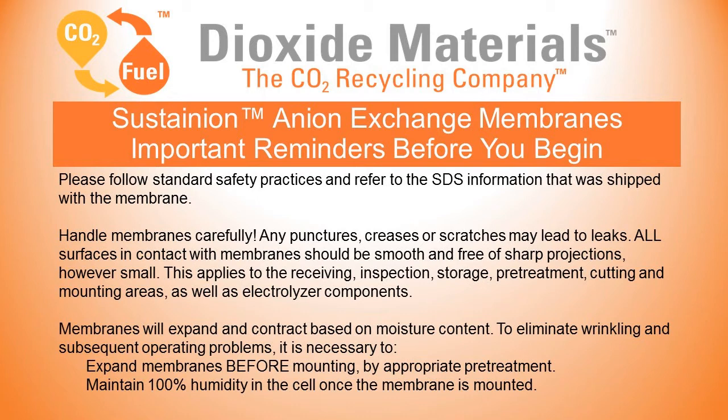Everything must be dust-free, however small. You need to make sure that this applies to any areas such as receiving, inspection, storage, pre-treatment, cutting, mounting, as well as electrolyzer components. The membranes will expand and contract based on moisture content.